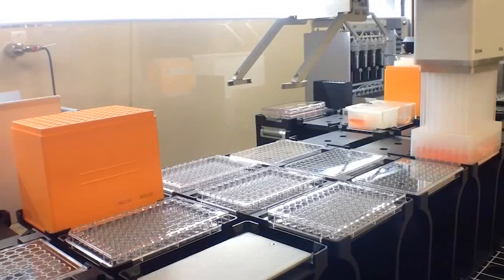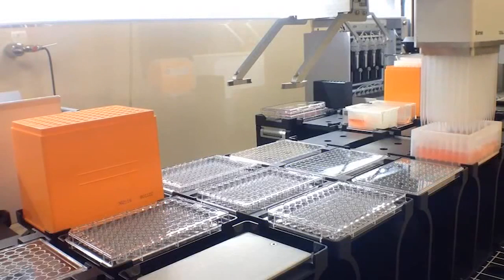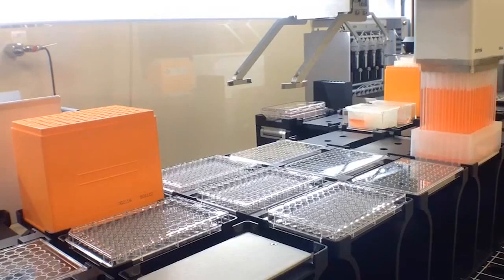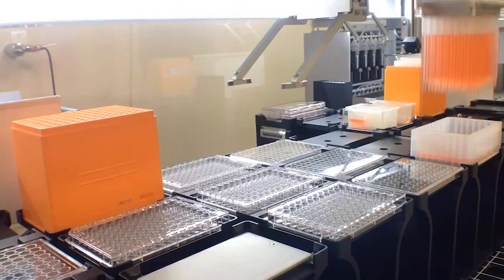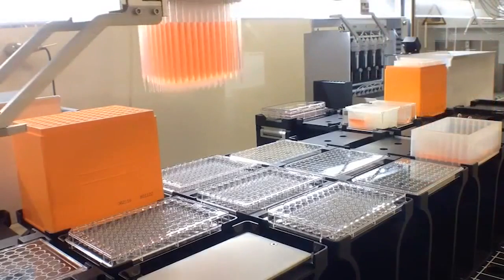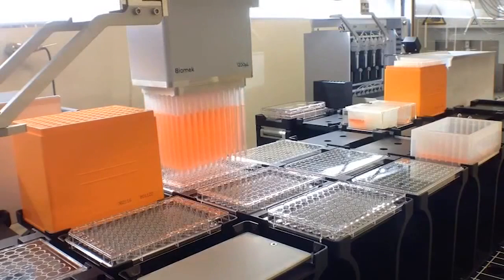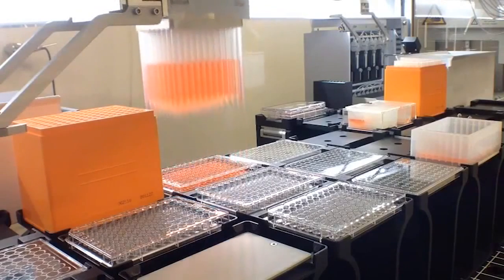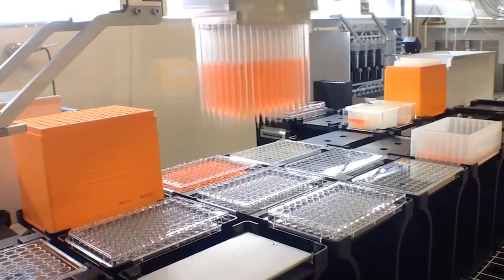In addition, we were able to increase the throughput by using a multi-dispense feature, allowing us to plate 4 96 well plates with 200 microliters per well in a single transfer step. Again, this can be used to increase the throughput and process numerous plates simultaneously or process as many plates in subsequent fashion as needed.